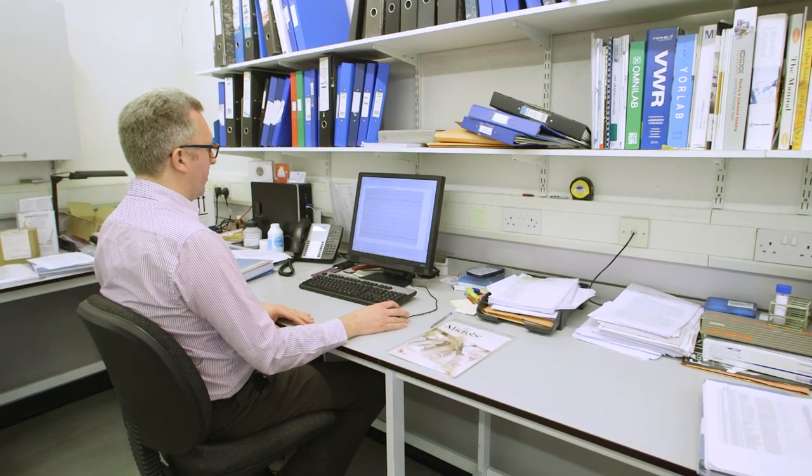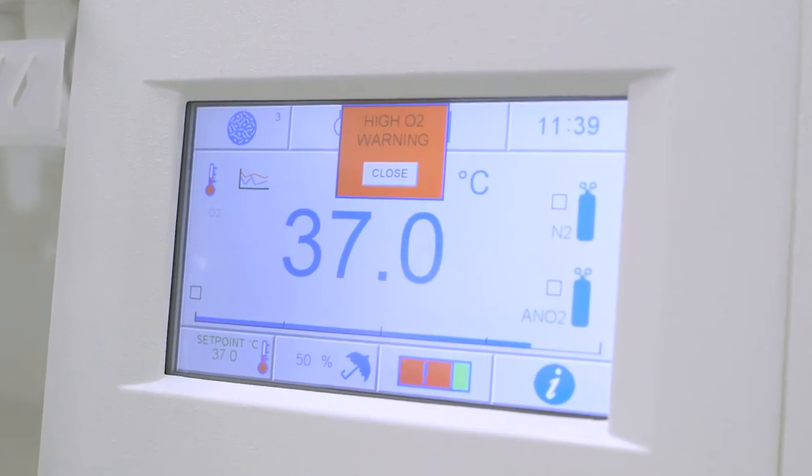The hypoxic station also allows data to be monitored remotely with alerts that can be sent direct to the user.